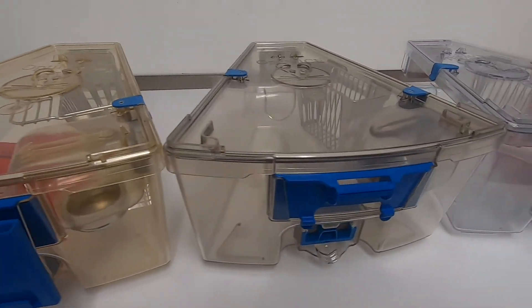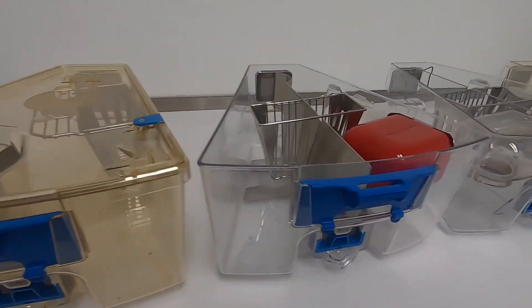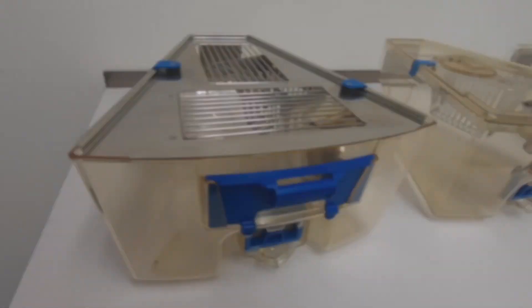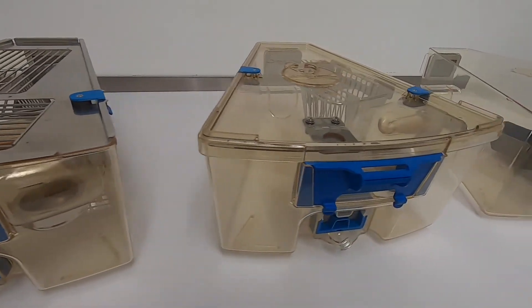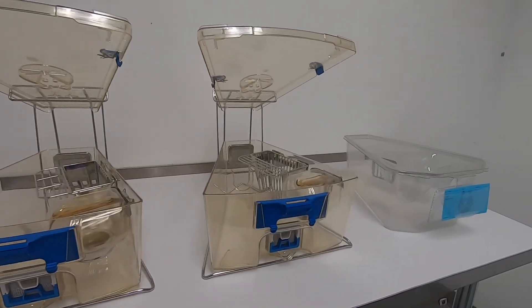Optimized cages are available in several types of plastic, have internal and external water bottles, are compatible with auto water, and have many accessories for your experimental needs such as perforated floors and dividers. Cage top props are an ergonomic and space-saving tool for cage changing in smaller cabinets.